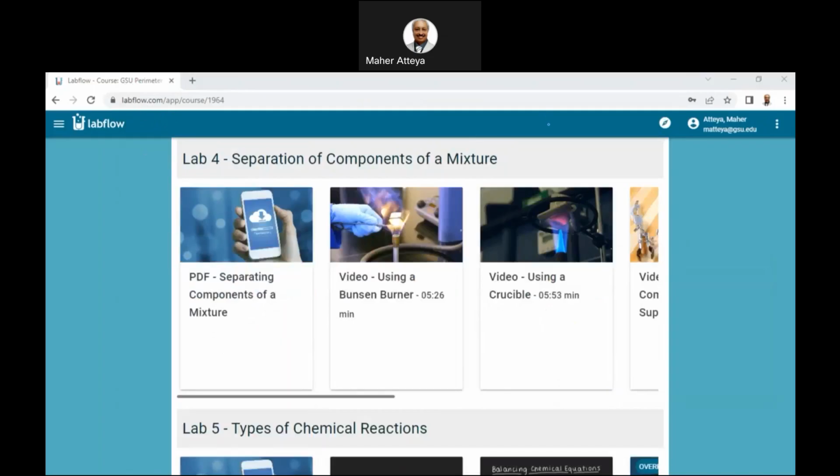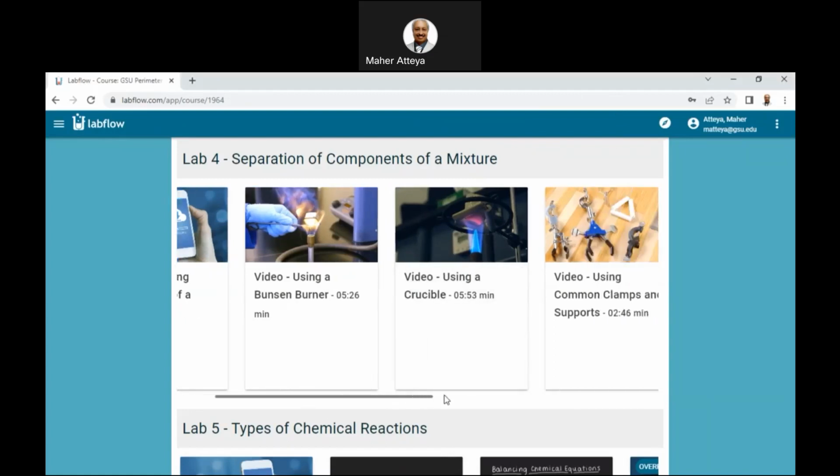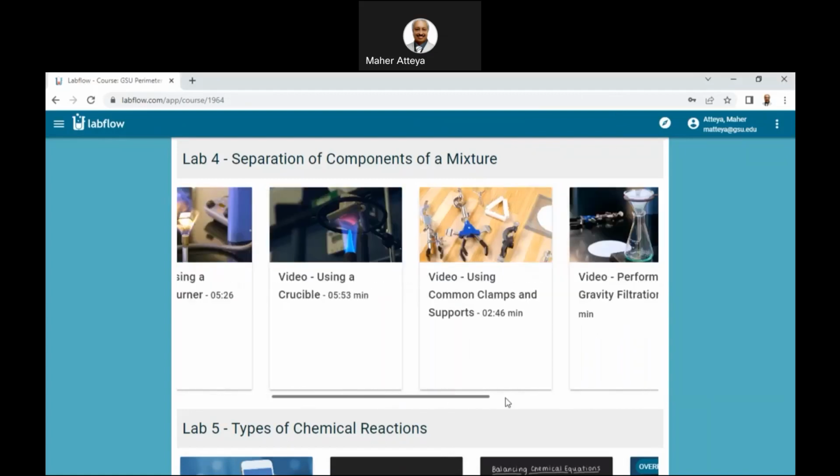I copy this, and then I am pasting this. So we will need to go through the major ones. Let me go for the second one, second snapshot. Let me take this one here, and then the second snapshot. We took those 3.